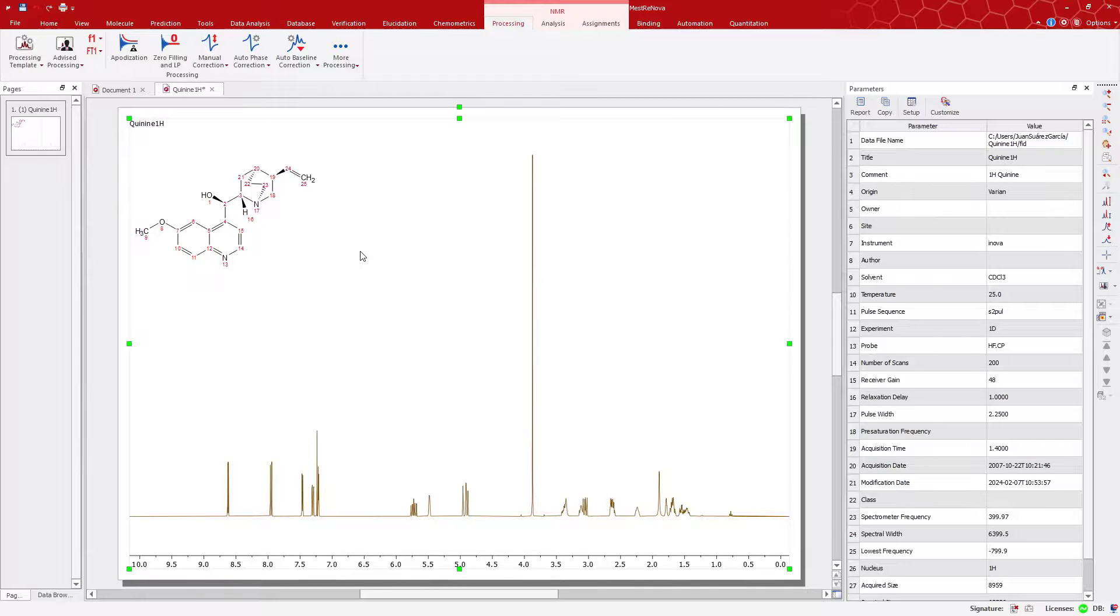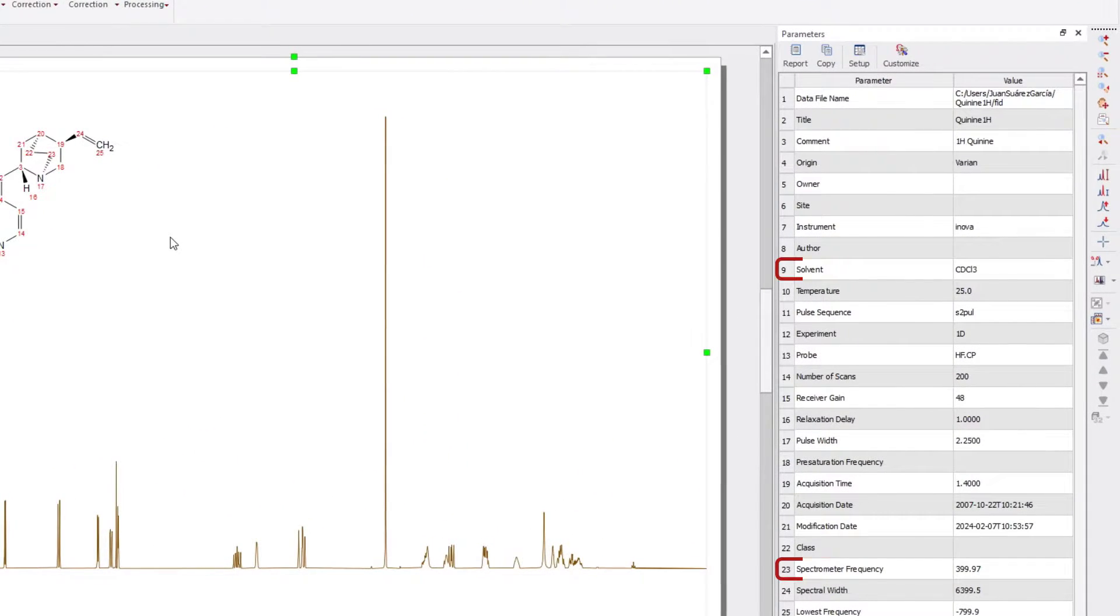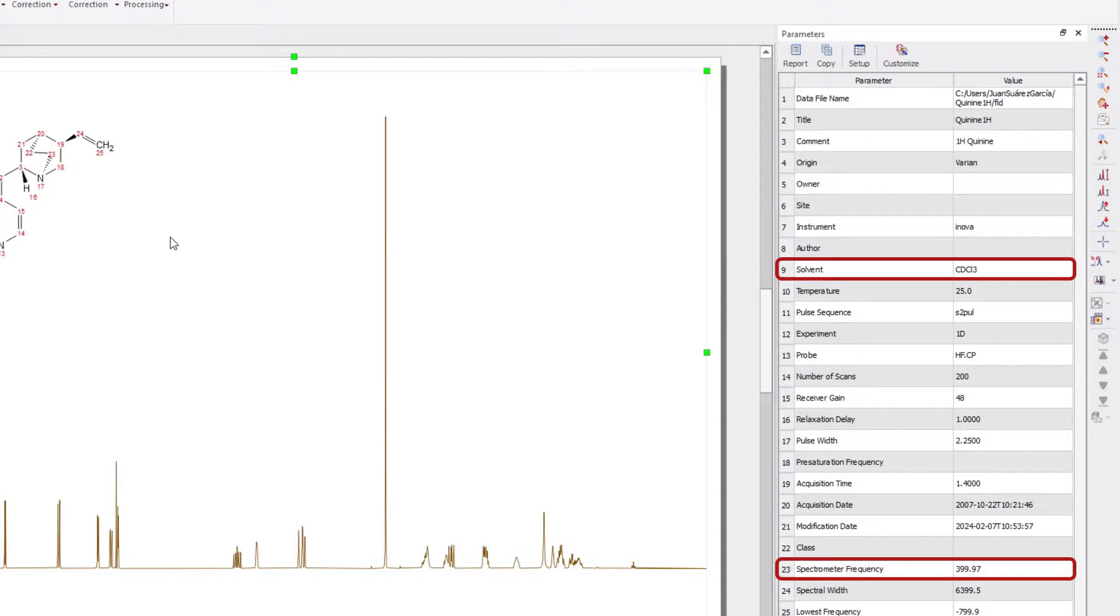Welcome! In this MNOVA tip, we'll guide you on incorporating the frequency and solvent parameters into your spectrum title.